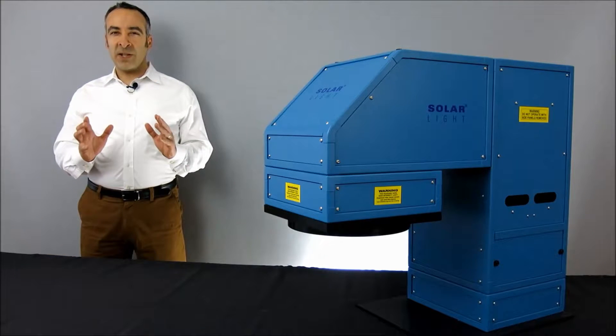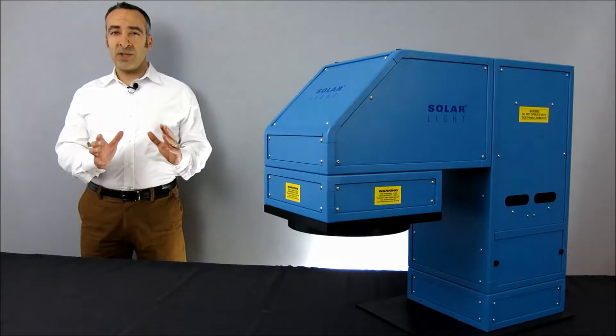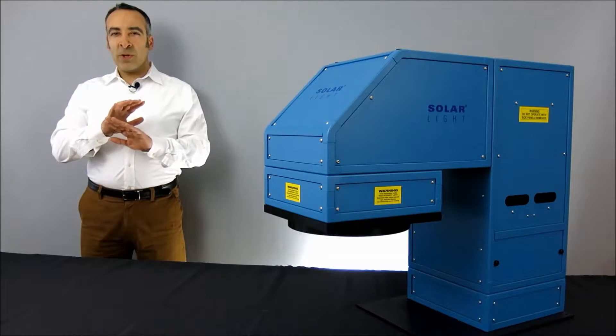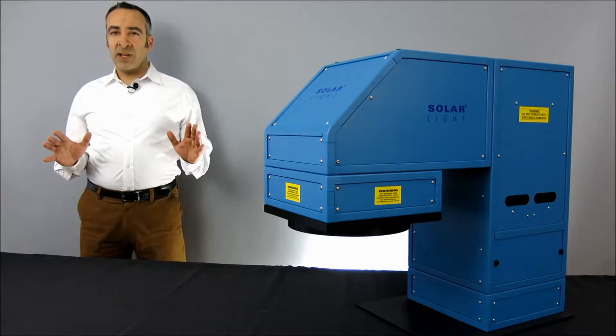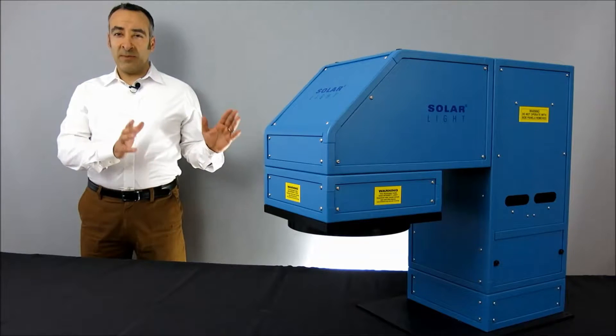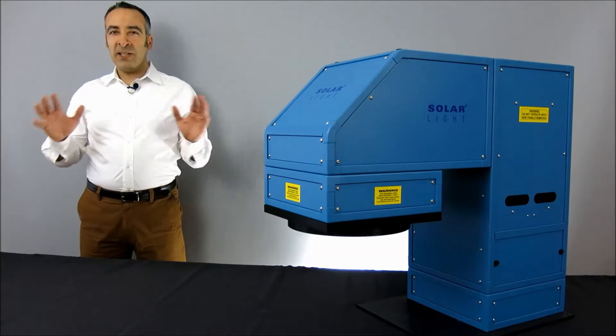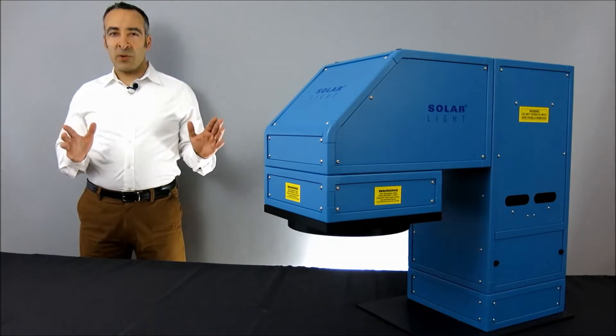Solar Light's LS1000 series simulators are high-precision light sources for both professional and laboratory applications. Although they're utilized worldwide for many different functions, we've combined these simulators with our high-quality meters, dose controllers, sensors, and other hardware to create complete turnkey kits for the most popular applications.